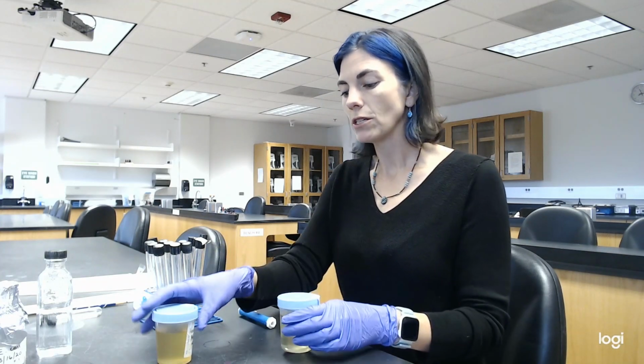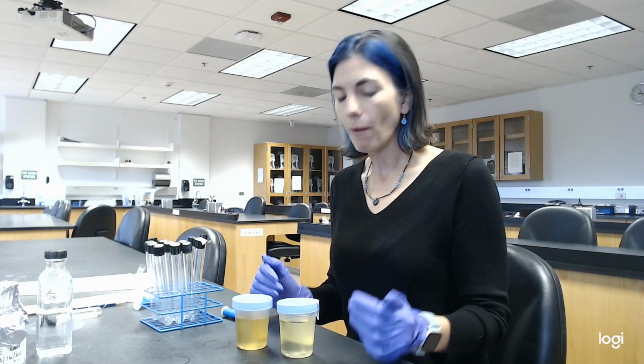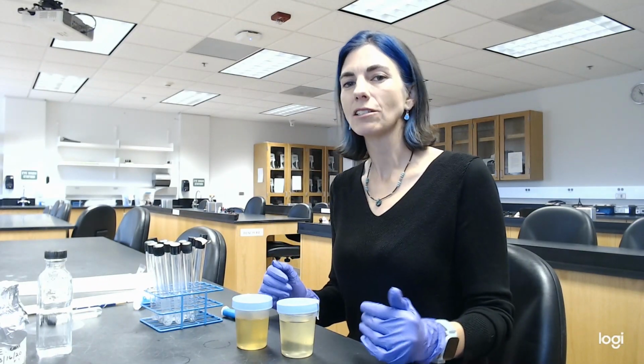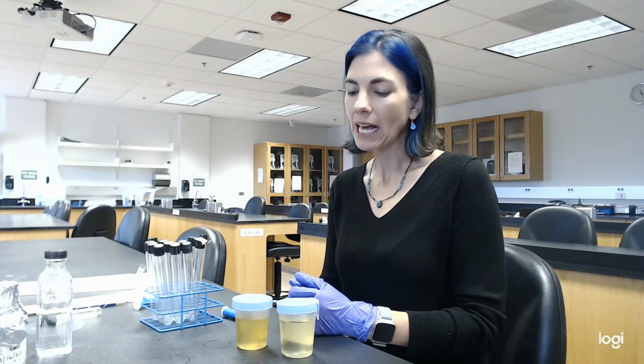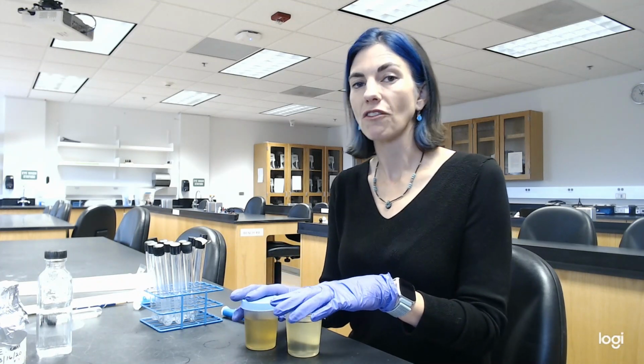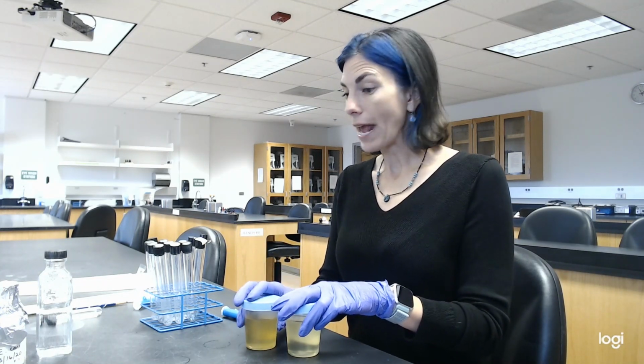So it wasn't the ideal setup, but it is a setup where I tried to reduce as much noise as possible. For instance, I drink coffee, and I tried to make sure that the time after drinking a cup of coffee was pretty consistent so that both of them had the same amount of caffeine in the urine if that was going to impact it. I tried to keep some other stuff consistent as well, but obviously it wasn't perfect, as evidenced by the fact that I've actually had 2 different colors, suggesting at least my levels of hydration were different. Okay.